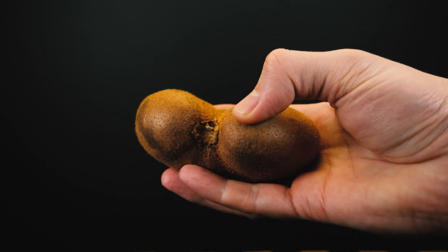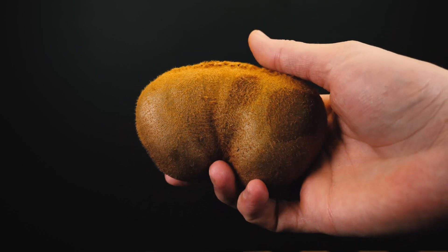I have always been interested in looking at the surface of a kiwi under a microscope. This is how the cut of the fruit stem looks like. Apparently, this kiwi was plucked a very long time ago.